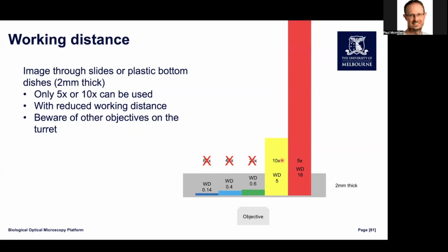We do have a couple of systems with long working distance lenses that can help for this. But try not to image through that thicker plastic or thicker glass. Try and mark your samples appropriately on the correct cover slip.